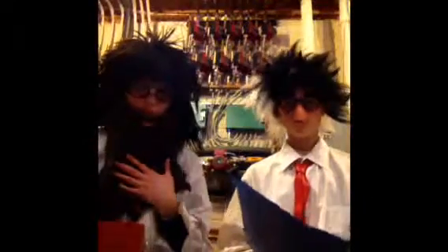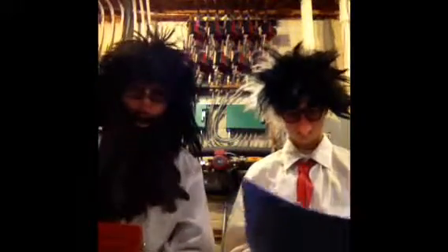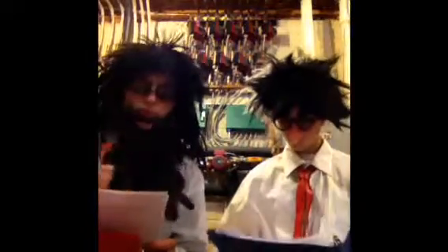Hello, Professor Red Foreman here, and my colleague Professor Beets, and we are two chemists that will be concluding this experiment. Here we go. The experiment had yielded results that were mostly in line with the hypothesis. The hypothesis stated that the red 40 would have the shortest wavelength of max absorption with the lowest pH. However, the sample of red 40 at the second lowest pH, a pH of 5, had the longest wavelength of max absorption. So the hypothesis was very close in saying that red 40 would have the longest wavelength of max absorption at the lowest pH. So it would be shorter. No, longer.